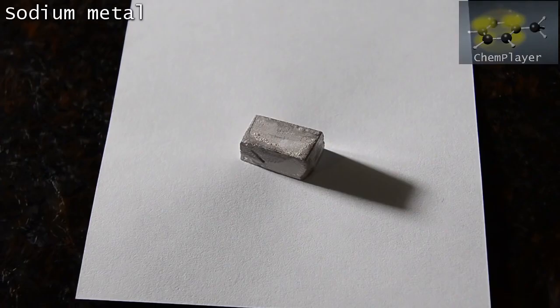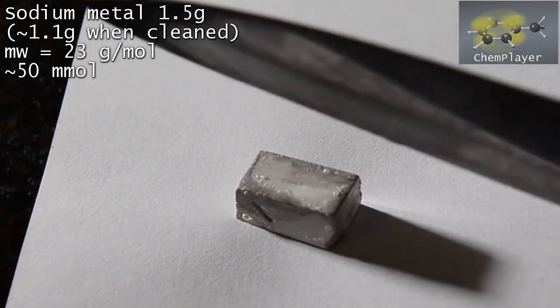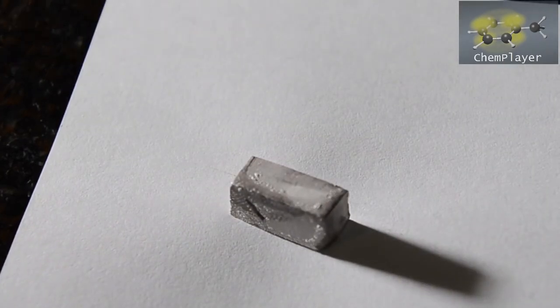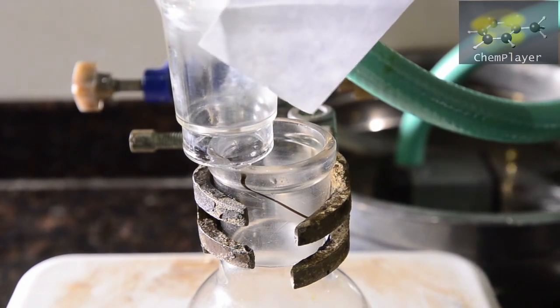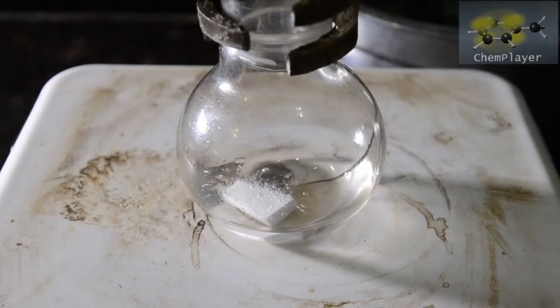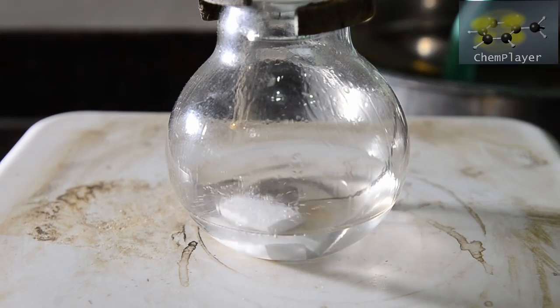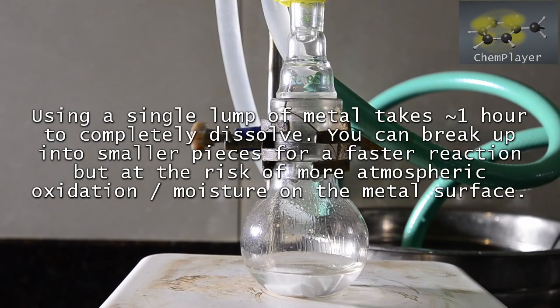Now we've measured out a block of sodium metal weighing around 1.5 grams. We're going to use a sharp knife and quickly trim the sides to remove any oxide, any hydroxide buildup. Then we quickly add the remaining sodium block weighing just over 1 gram to the flask. This reacts with the ethanol and bubbles away, producing hydrogen gas. The mixture also heats up and starts to reflux very slightly. The sodium metal takes an hour or so to dissolve, and towards the end it helps to switch on the heat so that the mixture refluxes.